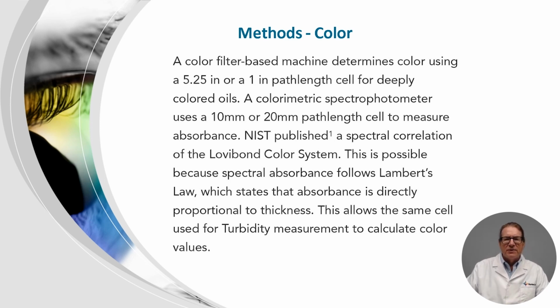These measurements allow one to use a spectrophotometer to measure the transmittance of a solution and then find the corresponding filter color. A spectrophotometer is an instrument that breaks light into component wavelength bands. For color measurement, typically 31 bands at equal 10 nanometer intervals across a visible spectrum is considered the minimum resolution recommended by the International Commission on Color, the CIE.